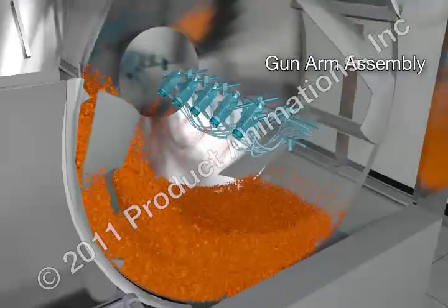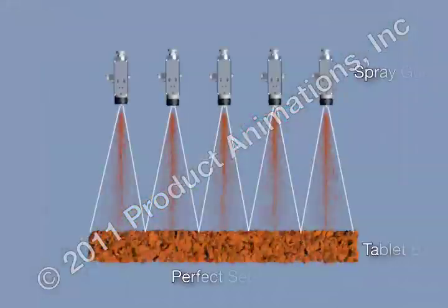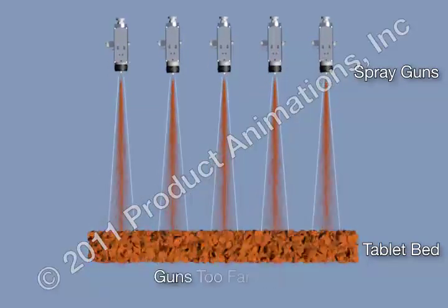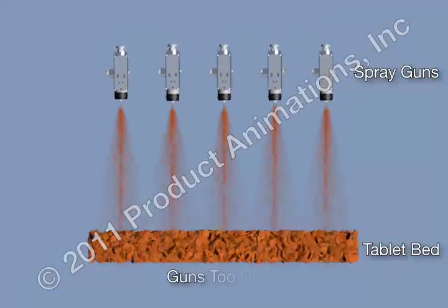A gun arm assembly permits easy access to each spray gun for adjustments, priming and cleaning. It is critical that the gun to bed distance is correct to ensure uniform coverage of the tablets.